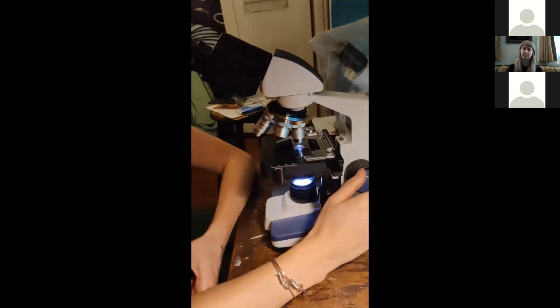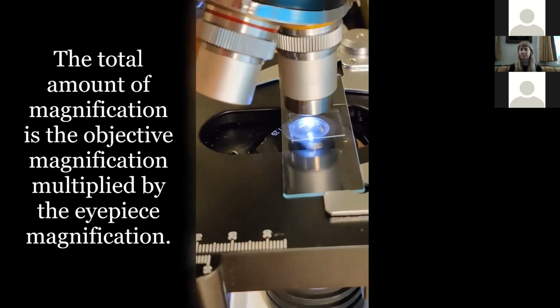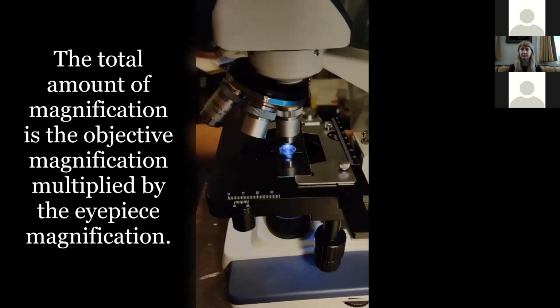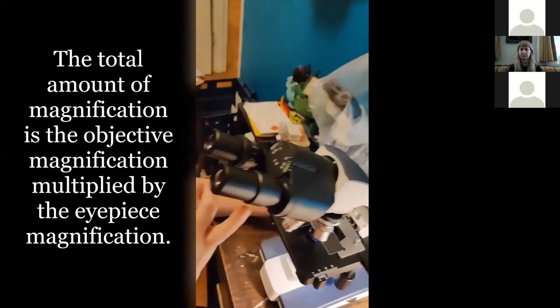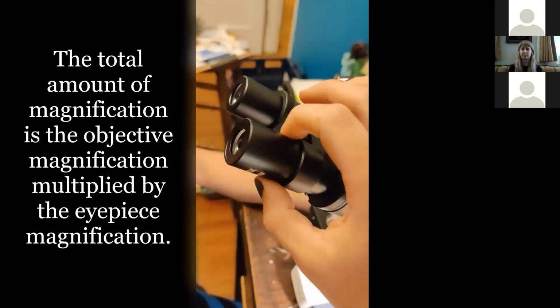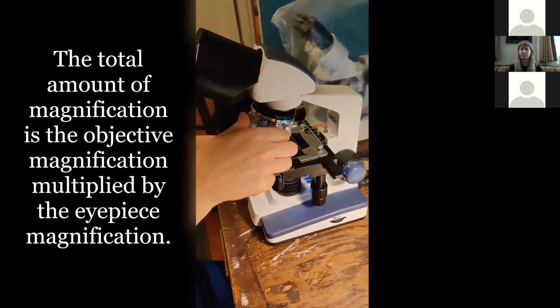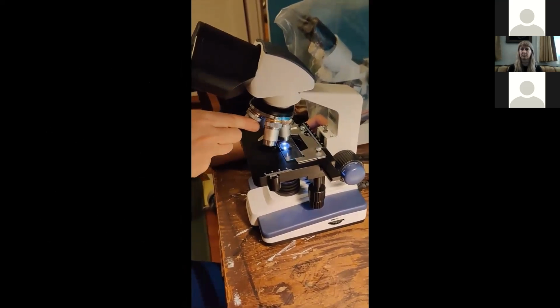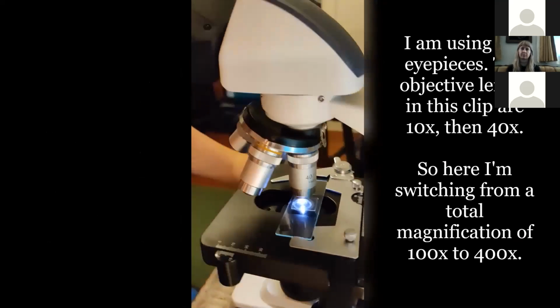I've got tons and tons of spores. This is great. Okay, but I am on the 10x objective, and I have 10x eyepieces on here. So I'm at 100 times magnification right now, and then I'm going to switch to the 40x objective, and that's times 10 for my eyepiece.